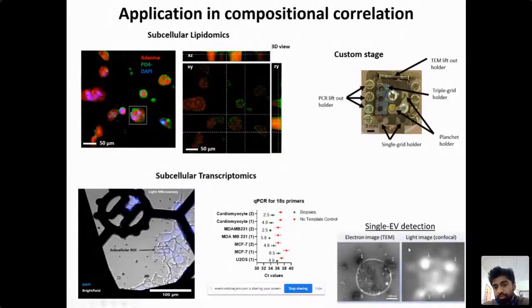I just put one image here to show my interests in vesicle analysis. So I'm a big fan of extracellular vesicles. So I've used the cryo-confocal first in non-cryo mode, actually, to identify single vesicles and correlate their structure. Basically, with a simple single image, you'd be able to get the purity, heterogeneity, and also the labeling efficiency of vesicles in high quality. We have moved to do this in cryo, but we are still improving the platform to get rid of background.